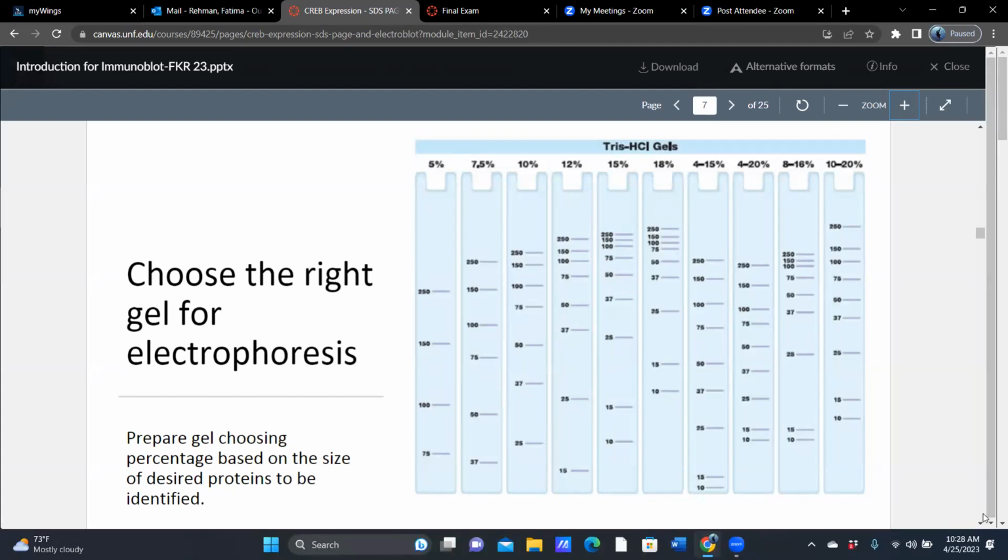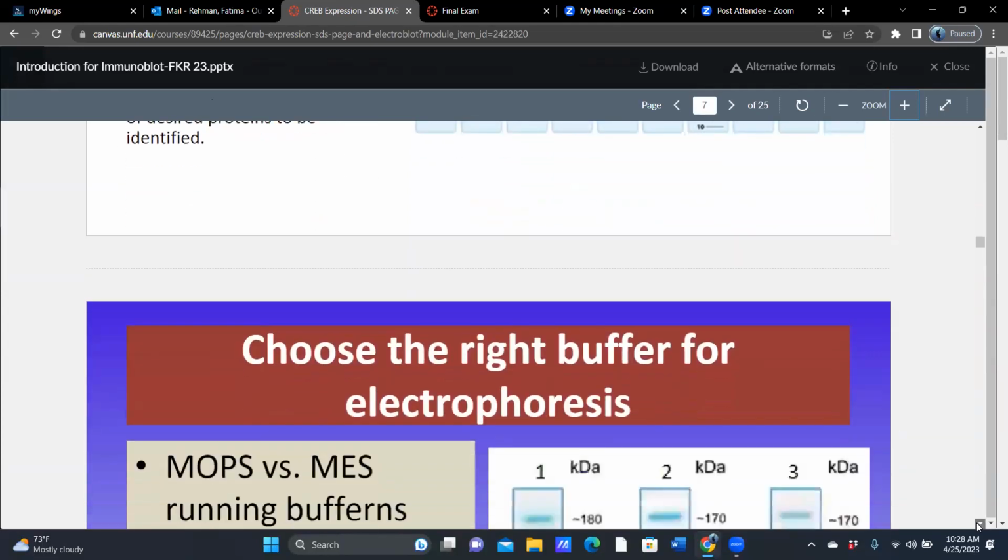So if you choose your gel wisely, you can run even 10 different antibodies on it, or at least 5 or 6 antibodies on it easily without having to even reprobe. You can cut out different areas of molecular weight range, put them in separate vessels and add different antibodies to them appropriate to that area and look at them. And that works out super well.